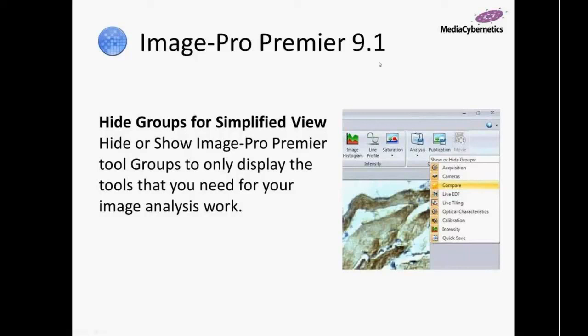You can see that here on my screenshot. Simply right-clicking, I'm able to then look at all the groups available in the tab. By left-clicking on the name, you will then hide that group from the tab. Now let's say you wanted to combine both of these options. We've added that as well.